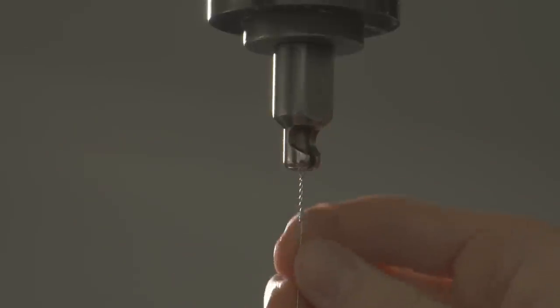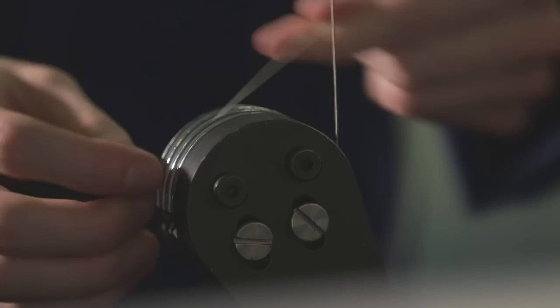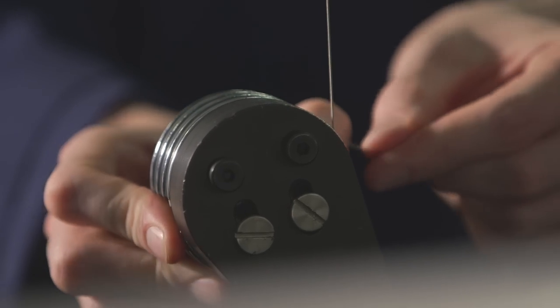The first analysis is a mechanical test. We're gauging the tensile strength of the Paradigm wire versus other traditional wires from industry leaders. This will be done through a series of tensile tests to gauge the ultimate strength.